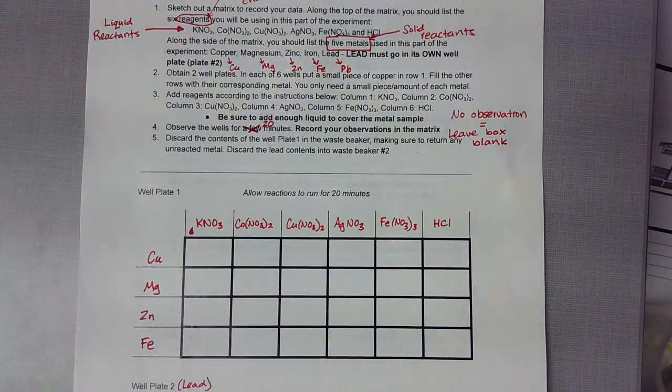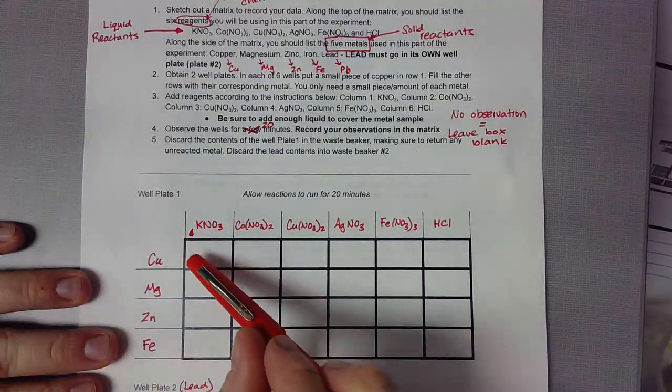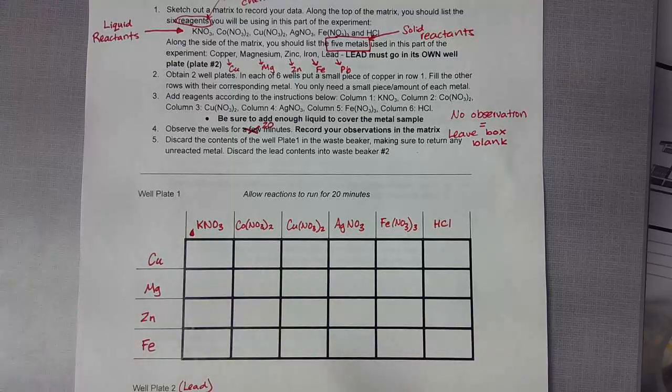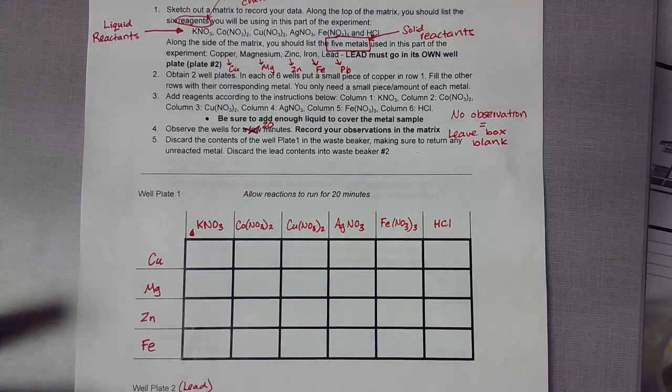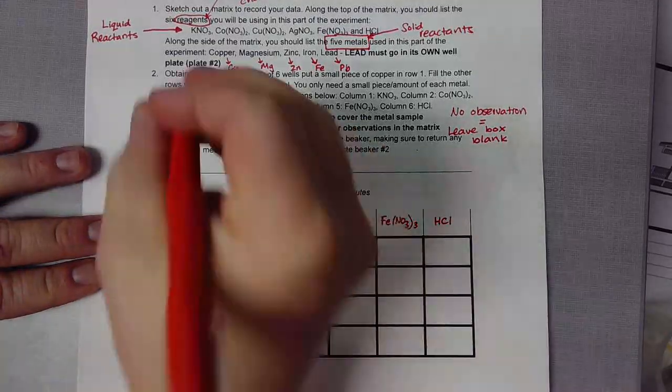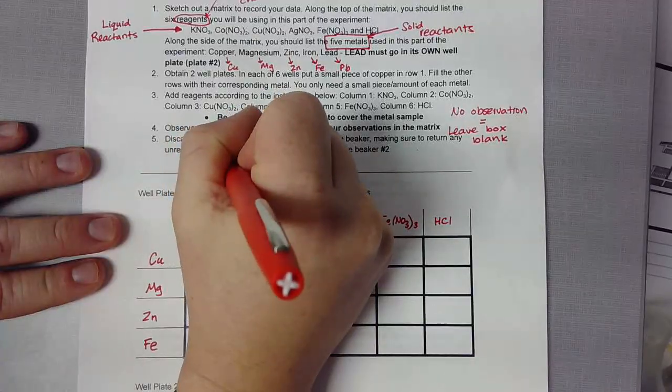Don't muddle up your data collection table by writing in the word nothing. Just leave the box open and blank. At the end of 20 minutes, we will do all of the discard, same way we've been doing it all year. Waste containers are going to be at the front, nothing down the drain.